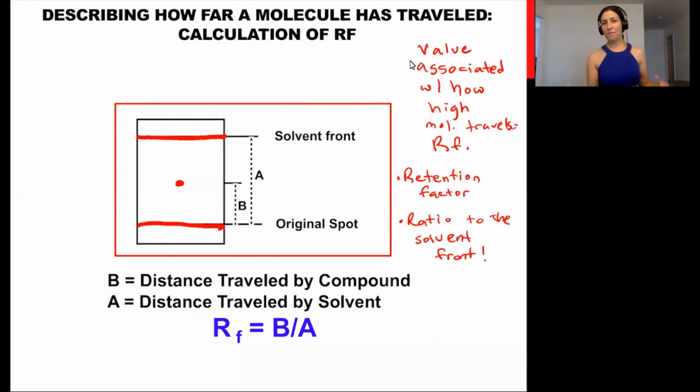So when we look at a TLC plate, they're actually quite small. So it's not very easy to use whole number inches to differentiate the distance that two compounds might have traveled. And we hate to get into tiny, tiny discrete numbers and have to measure from the line to the spot and just report that.